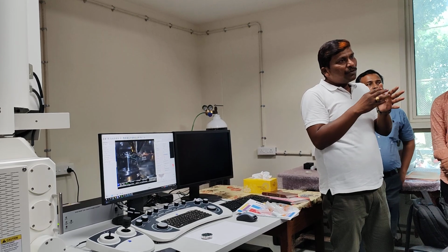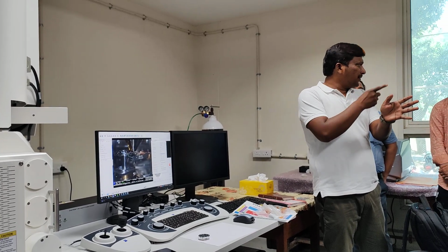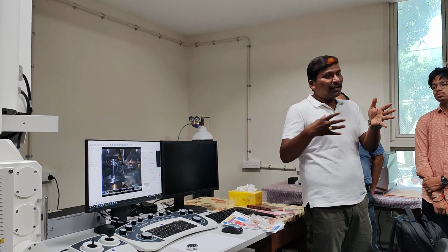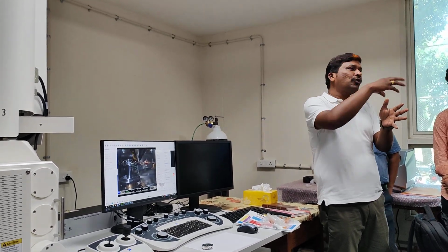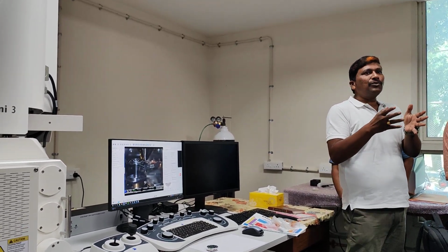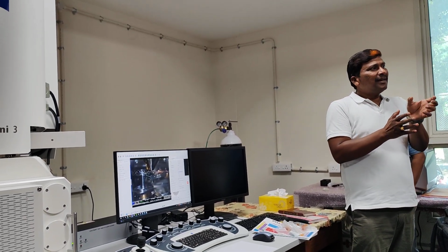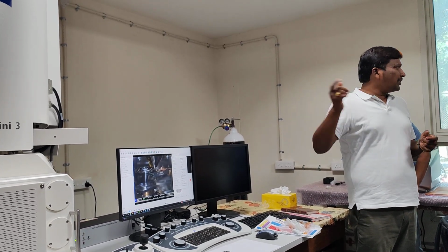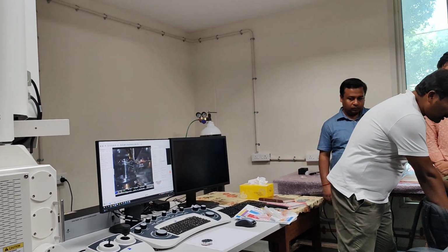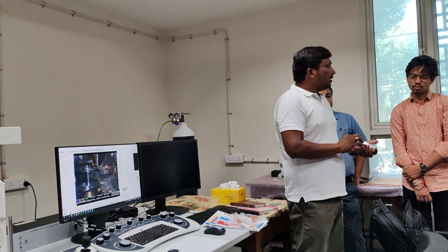If you are not able to understand the porosity or the size of these pores after certain cycles of electrochemistry, because you do a lot of electrochemical reactions through that polymer, you won't understand how much material transfers from one electrode to another, or what the active area is after certain cycles. That is why batteries lose efficiency after certain cycles, right? Because there is a lot of change in the membrane electrode assembly. Those are all information you can image, though it is difficult to handle such a beam sensitive sample. But this system has the capability of handling polymer samples.